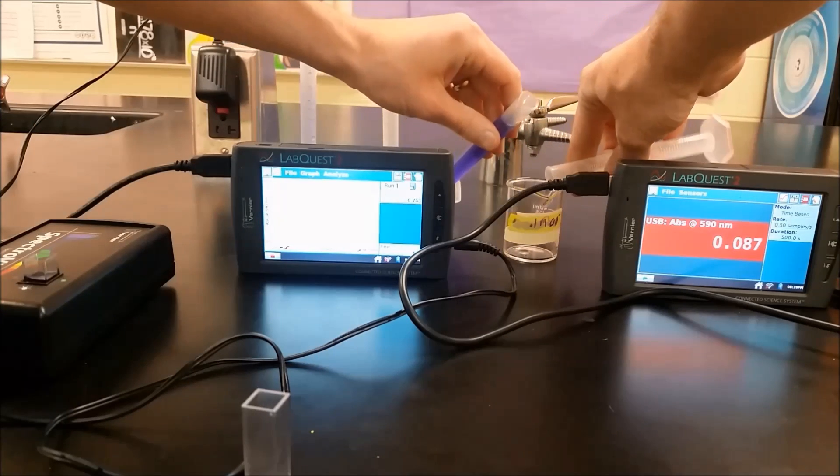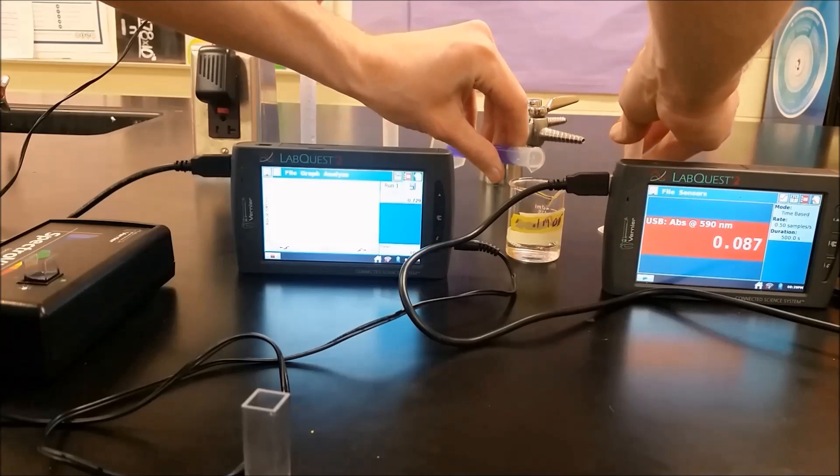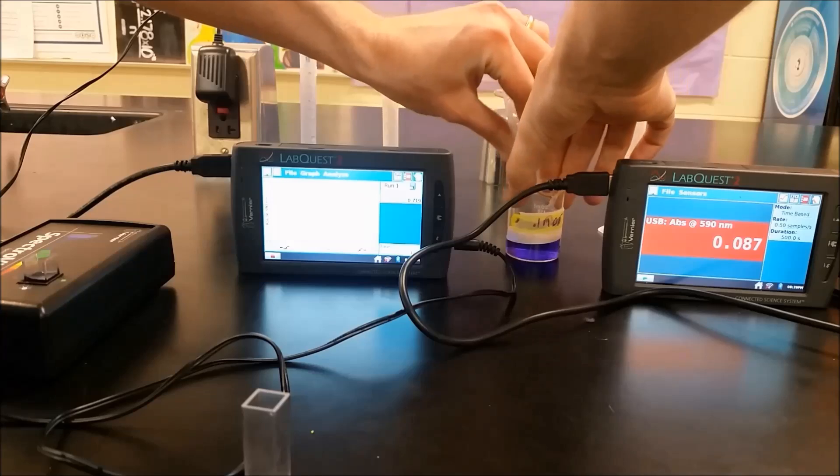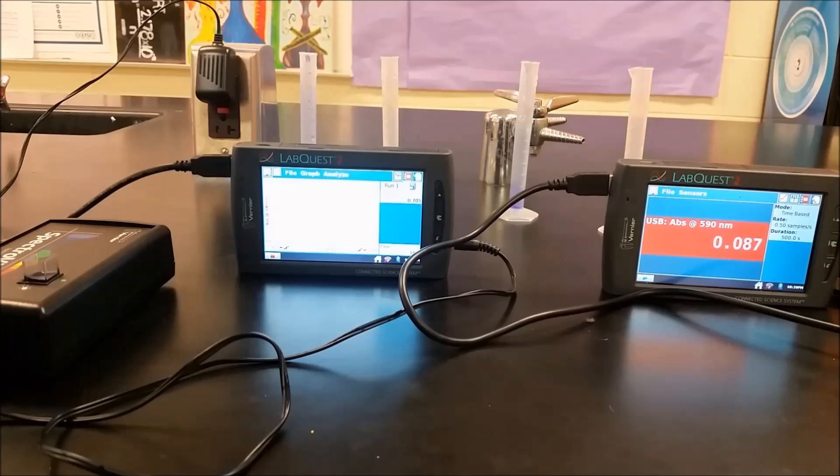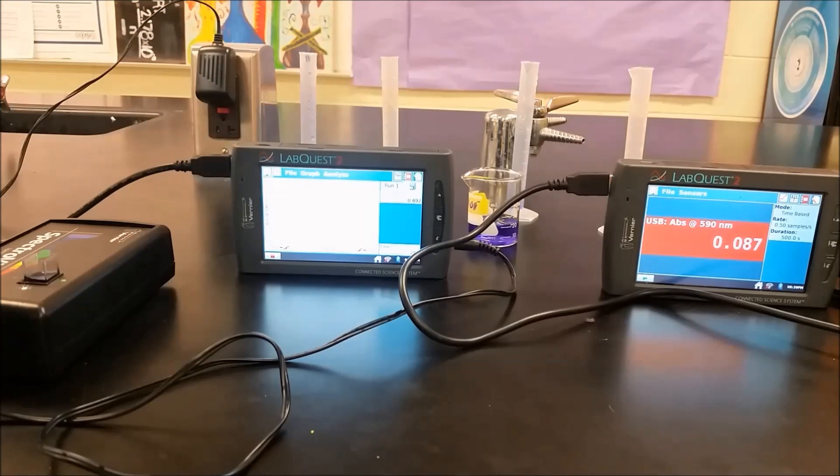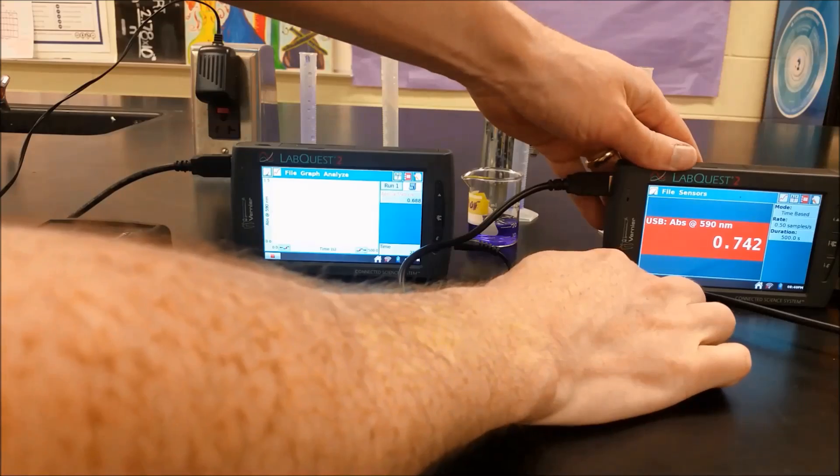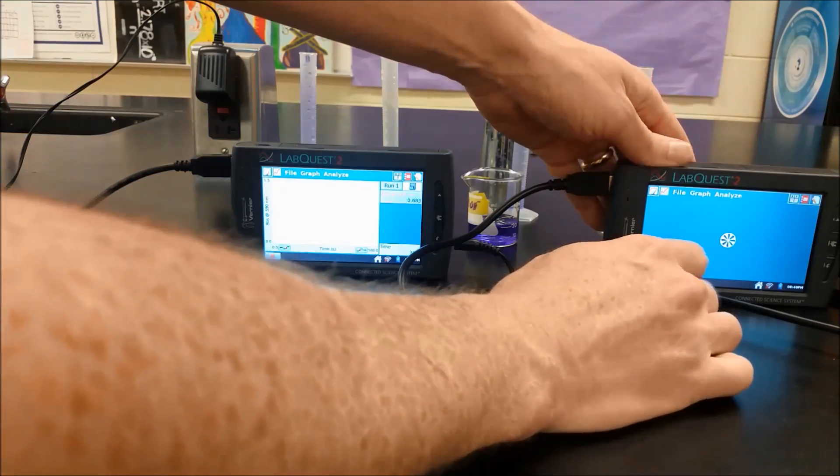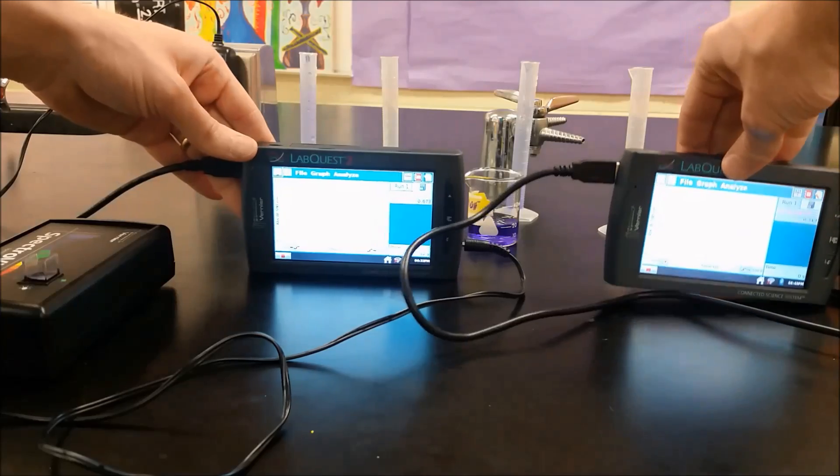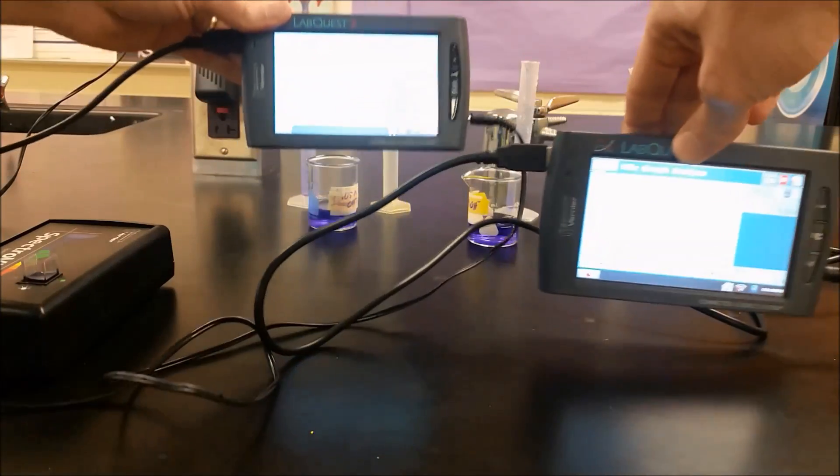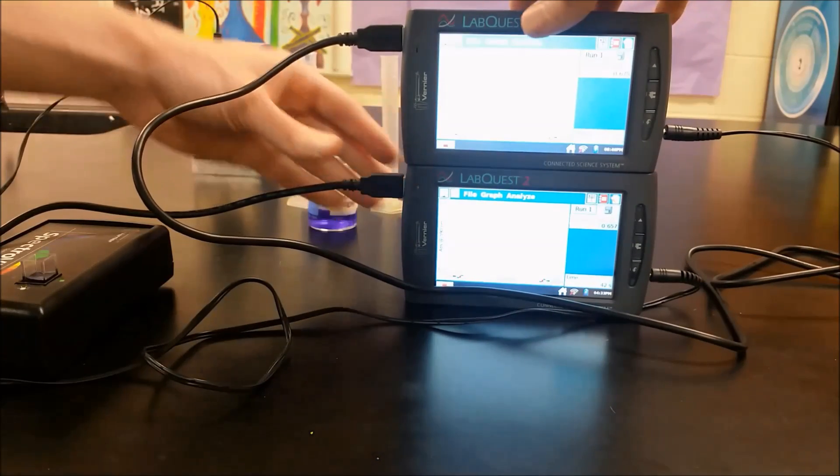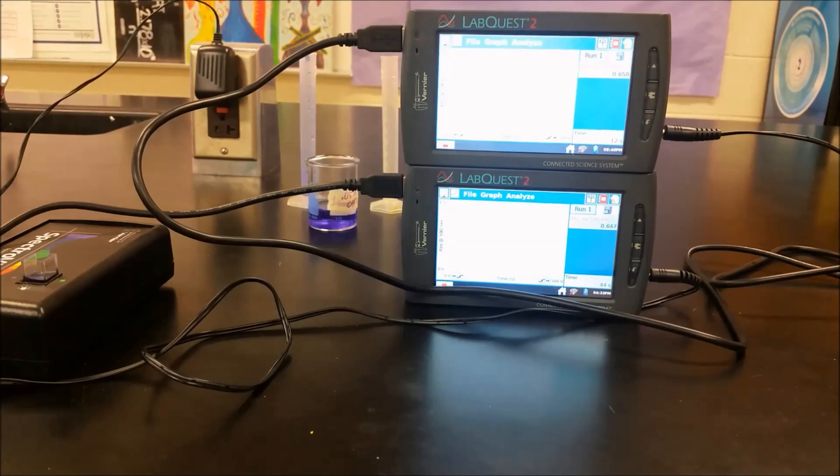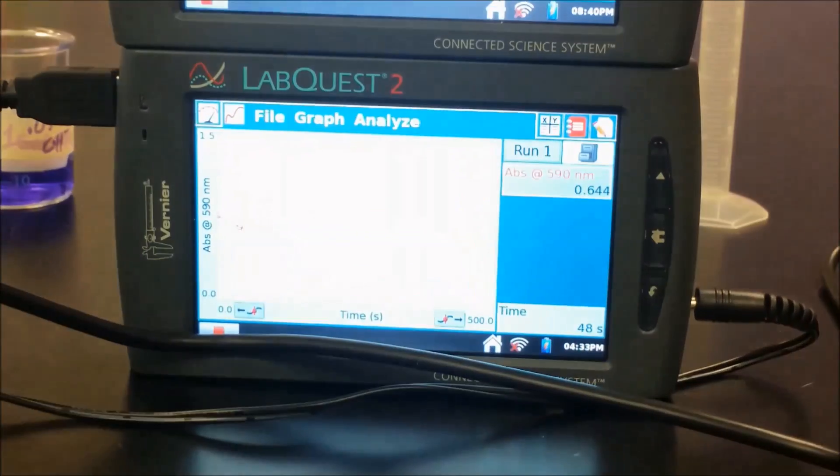We're going to go ahead and mix these as well. And we're going to go ahead and hit play on this as well. So now we have both of these running. So I'm going to go ahead and take this one and stack it on top of the other one. And we'll go ahead and zoom in so we can speed this up and see how this turns out.